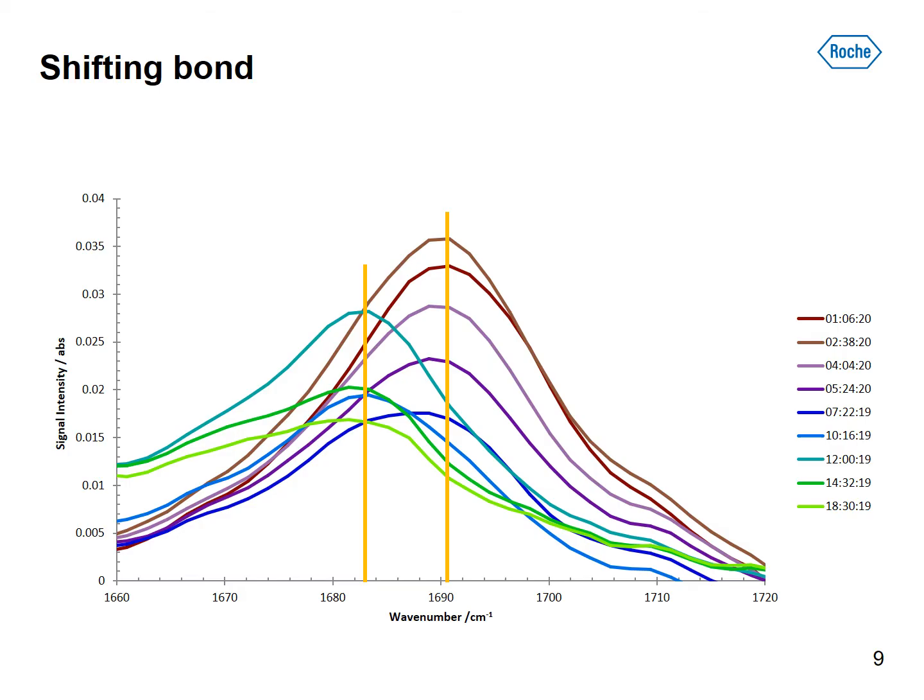We also had a closer look at the IR spectra measured during the experiment, especially at the signal at 1688 wave numbers. The signal decreases during the experiment, shifts, increases slightly and decreases again. A possible cause would be a liquid-like cluster as described in the publication of Roche et al.